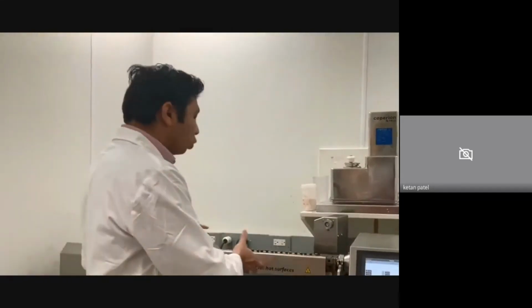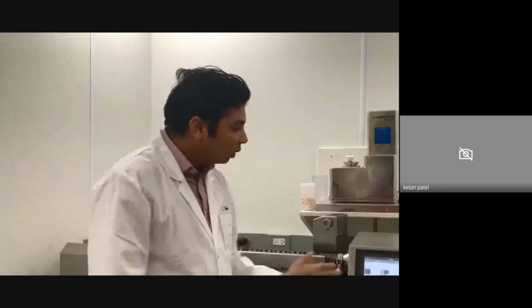The key is the miscibility of a drug. When we do this processing, it is ideal that the drug is molecularly dispersed or in an amorphized state within the polymer. So we can adjust some processing parameters like temperature. There are about 7 zones, and we can adjust the different temperatures based on the Tg of a polymer and the melting point of a drug. At the same time there are material attributes like the polymer and drug chemistry, and the solubility parameter plays in between. So the first part of FDM 3D printing, you should have a nice polymer-drug mixture which is miscible and gives you a transparent, nearly transparent filament where your drug is evenly or molecularly distributed.